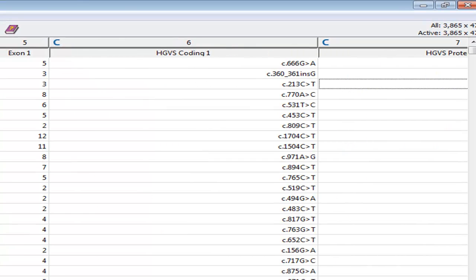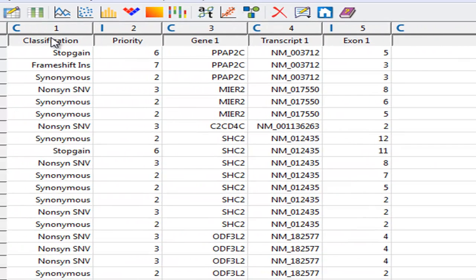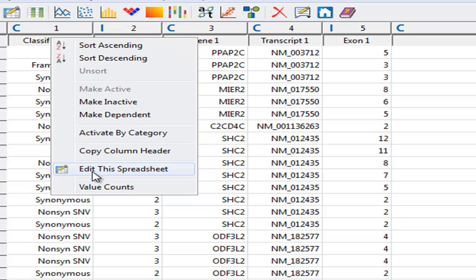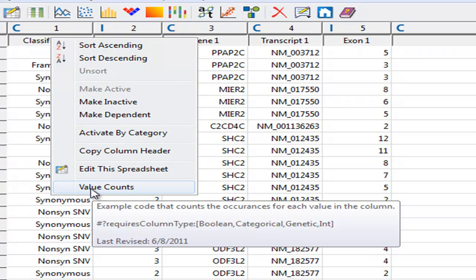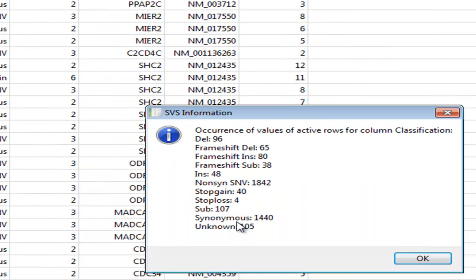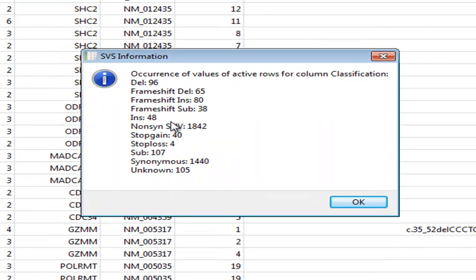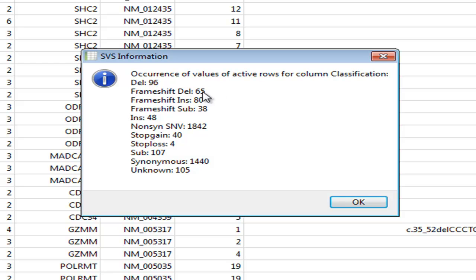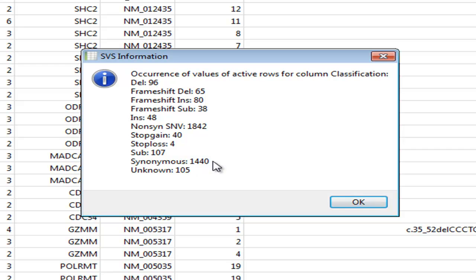Using the right-click menu of this column, we can use this feature called Value Counts to get a quick overview of what's contained in this column for this spreadsheet. This is a nice way to say, oh wow, look, we actually have some fairly damaging mutations in this data set. This may not be in every sample, but at least one sample has some frameshifts, deletions, insertions, and substitutions, as well as stop gains and stop losses. But as you can imagine, quite a few of these variants are synonymous. So let's use those synonymous variants as a filtering tool.